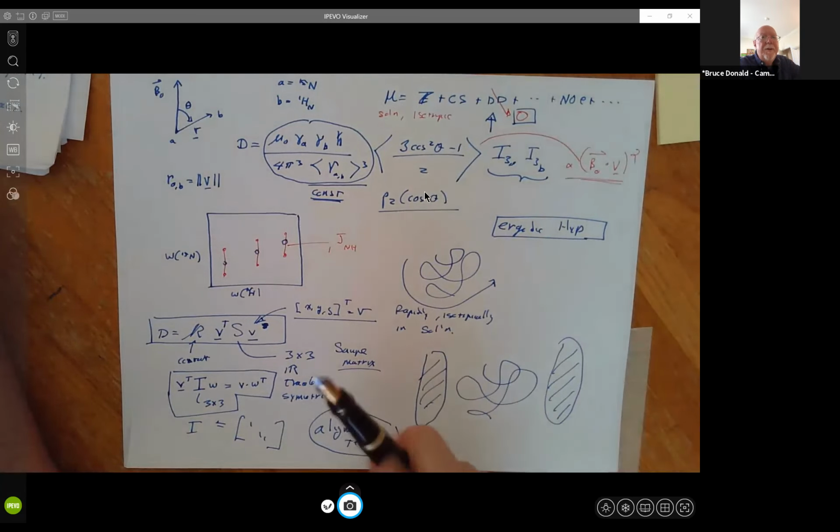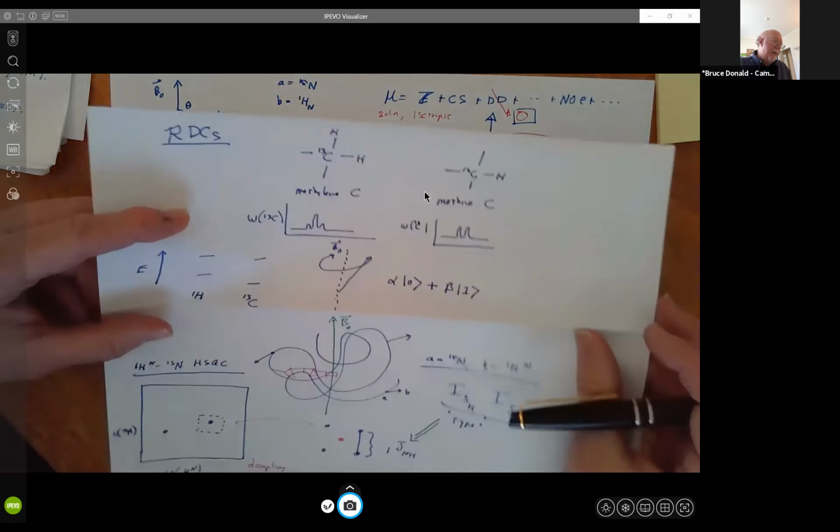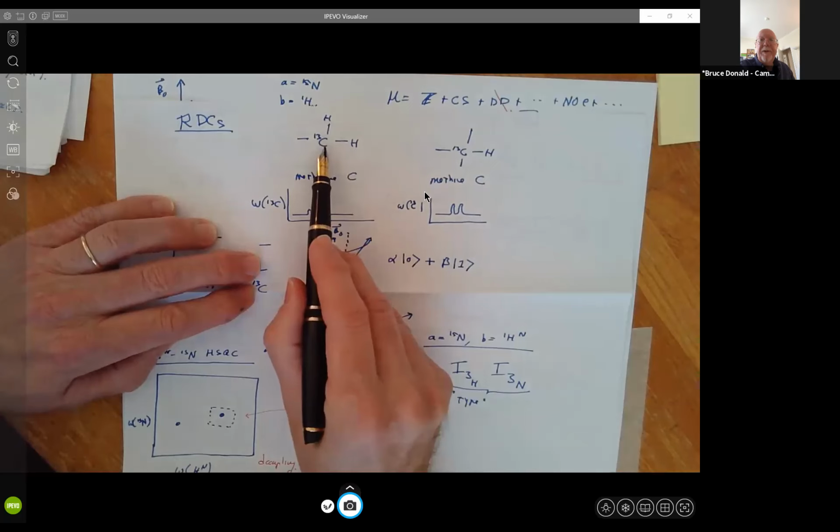No, the decoupling and the zeroness of those are actually two different phenomena. The decoupling is a different question, and it comes down to whether or not the attached spins split a central spin, right? And we're not going to get around that.